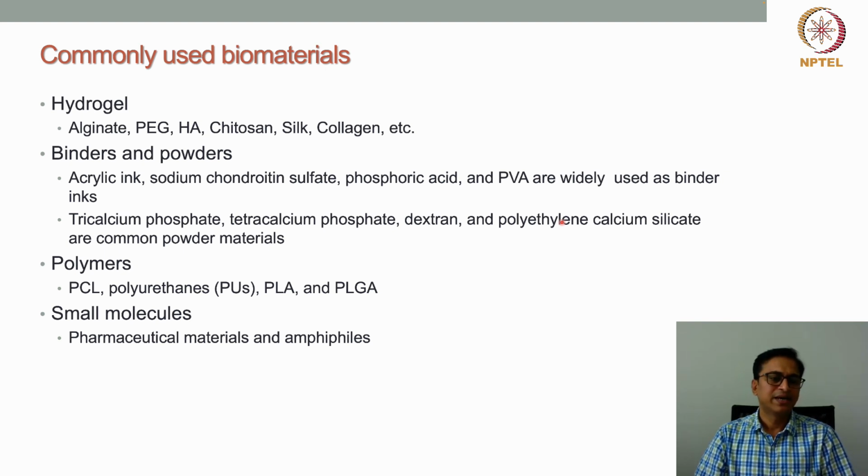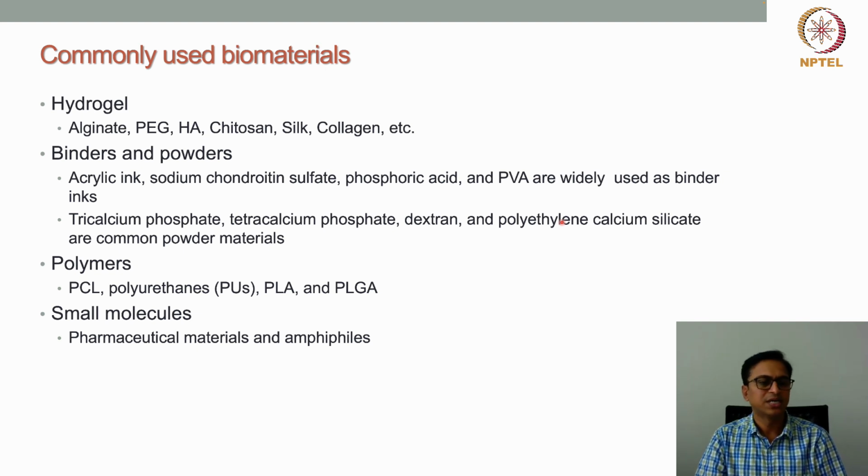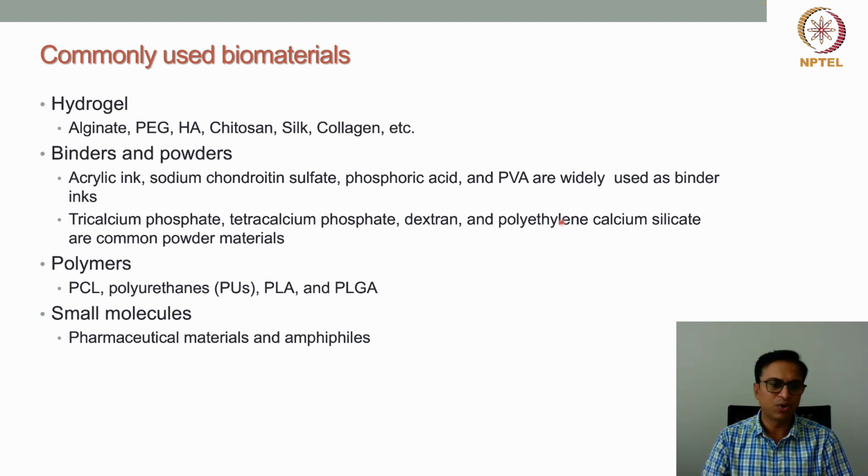Similarly, in inkjet printing, various polymers are also used. I have written here only four examples: PCL, polycaprolactone, polyurethanes, polylactic acid, and polylactic-co-glycolic acid. Similarly, there are various types of polymers, either in aqueous solvent or in organic solvent, where all these different types of polymers are mostly used.